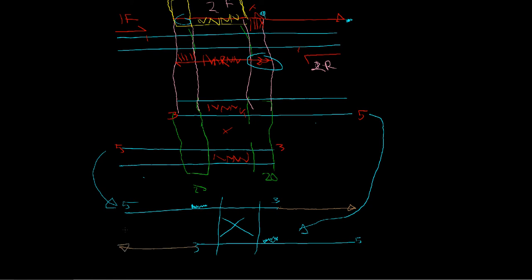If we include primers, we're going to be able to turn this into a chain reaction. And this fragment that has been sewn together with all of these ends is going to be favored as far as creating that reaction goes.